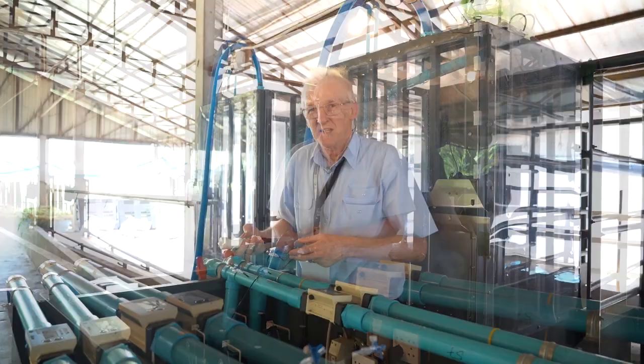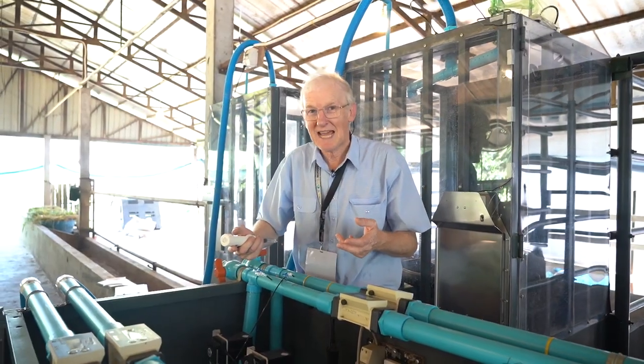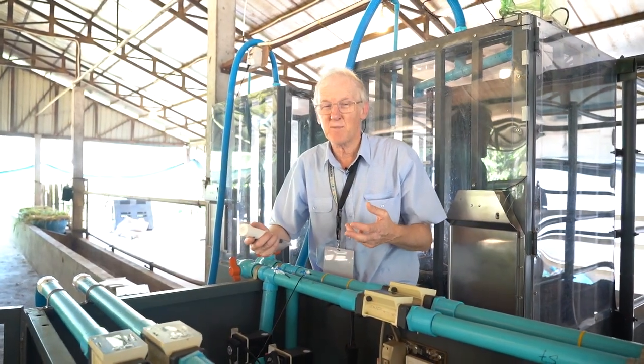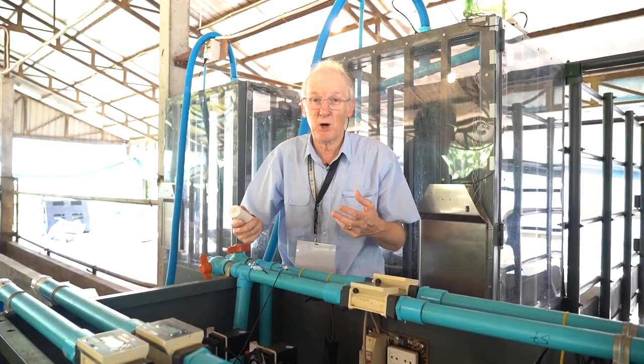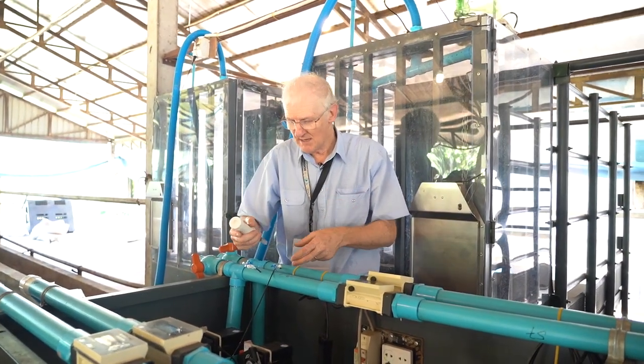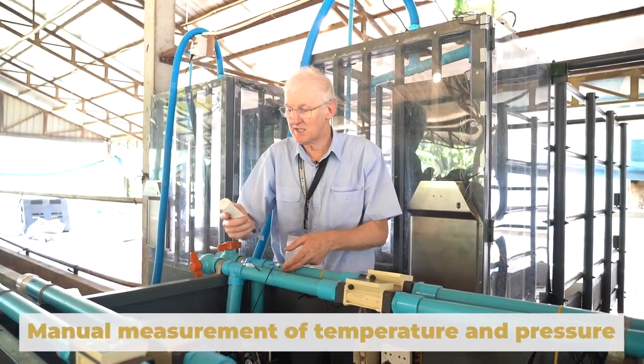Thank you. So whenever we are doing things with gases, we need to know the temperature and pressure. Sometimes the machines will monitor it and allow for it, but in this case it is a very manual system.